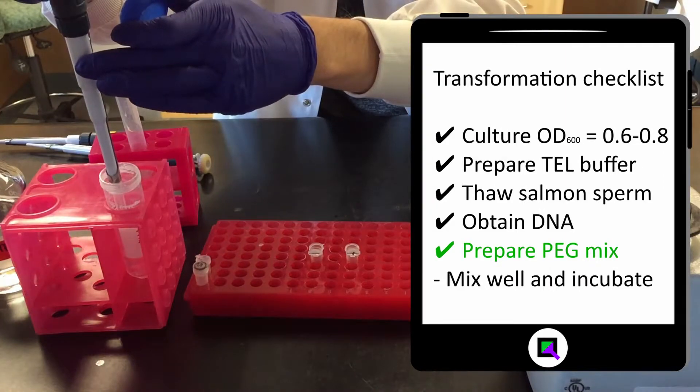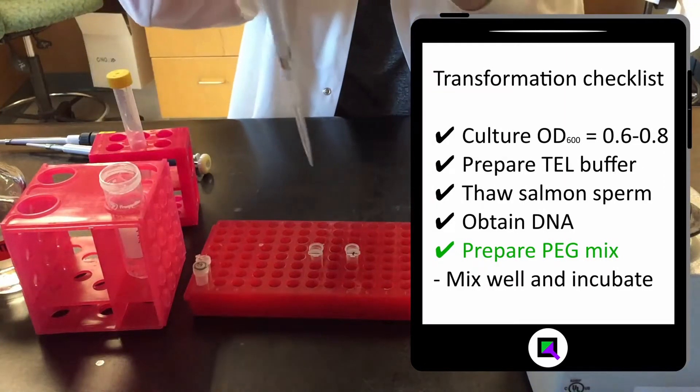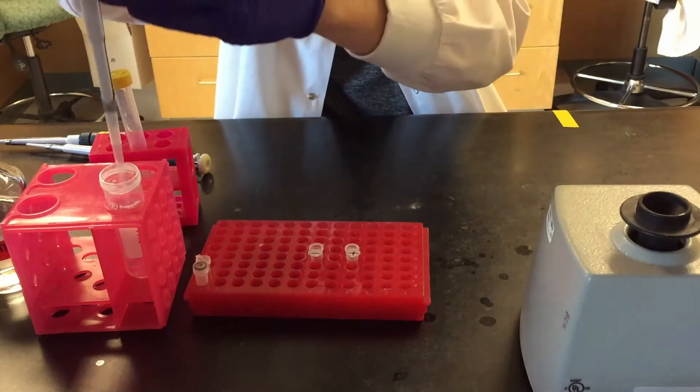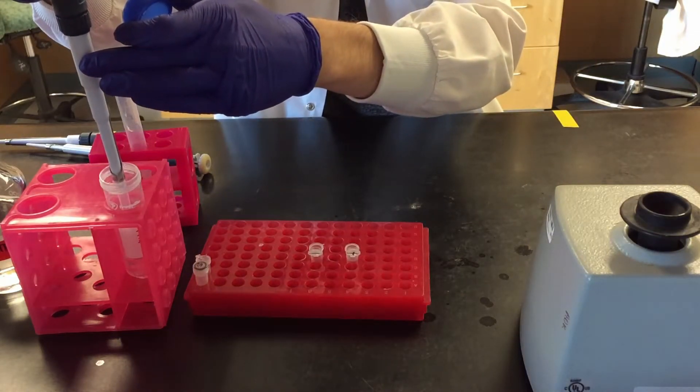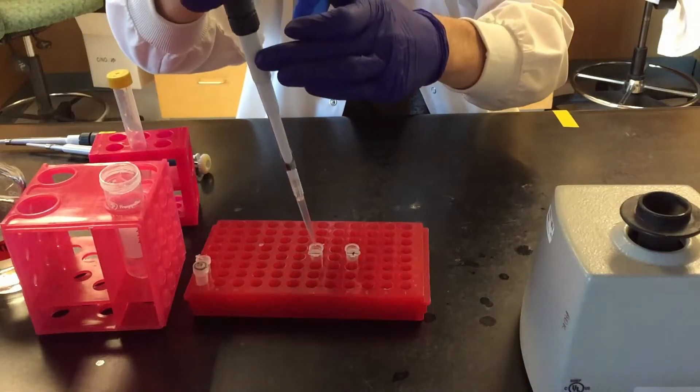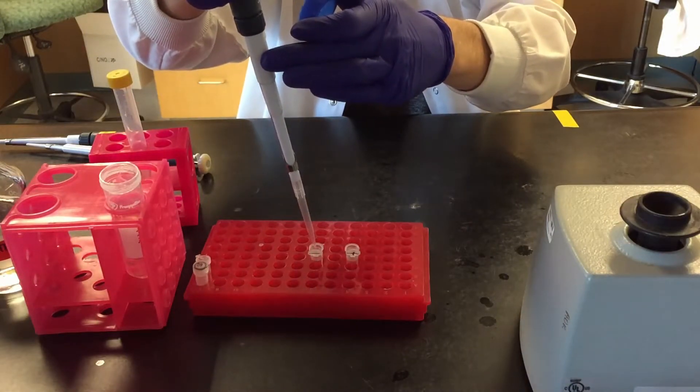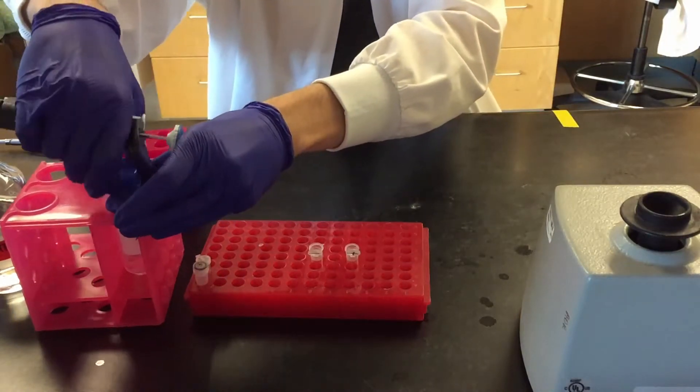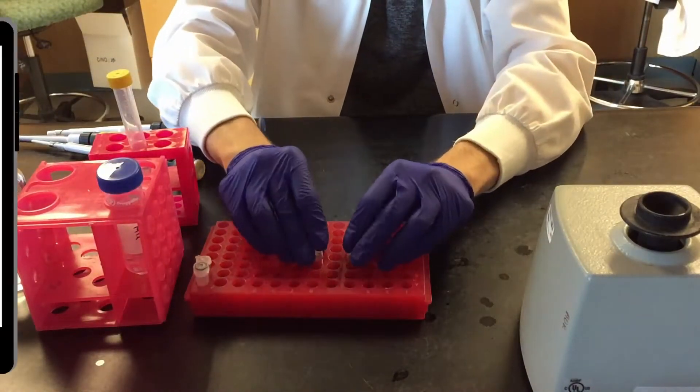Add 900 microliters of PEGMIX to each tube and mix well by vortexing. PEGMIX is polyethylene glycol diluted in Tel Buffer. PEGMIX is thought to improve transformation efficiency by altering the chemical environment around the cell to promote DNA uptake.